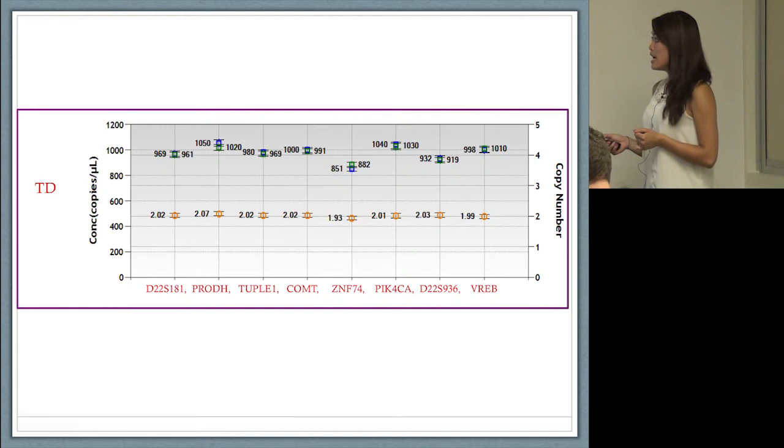Here I'm showing that we were able to determine a TD individual very easily. The green and blue dots represent the concentrations in copies per microliter. The orange represents the copy number values. A TD, a normal individual, should have two copies of all these primers.